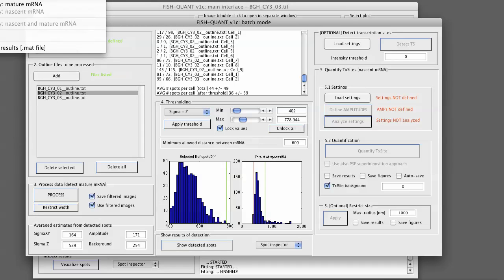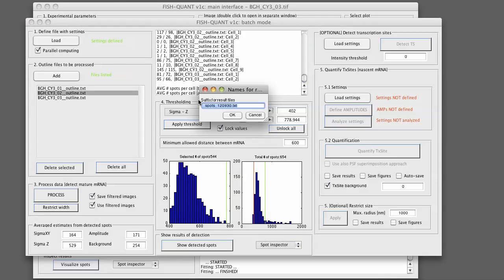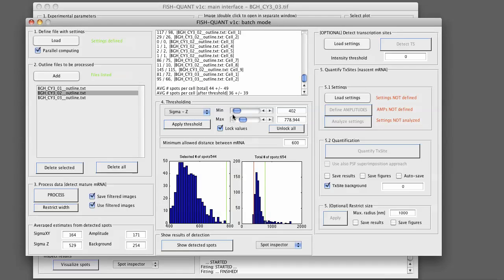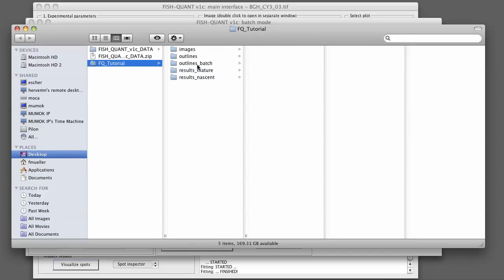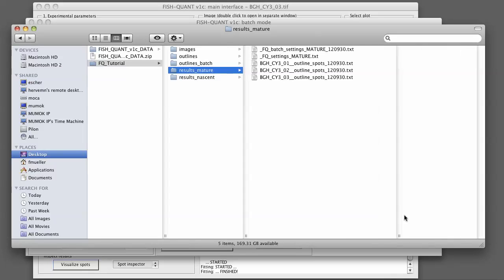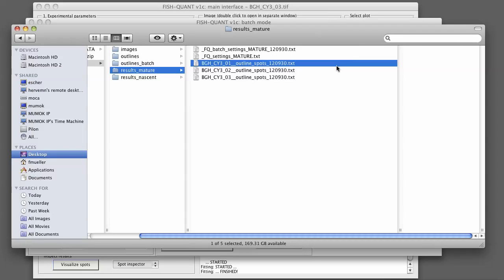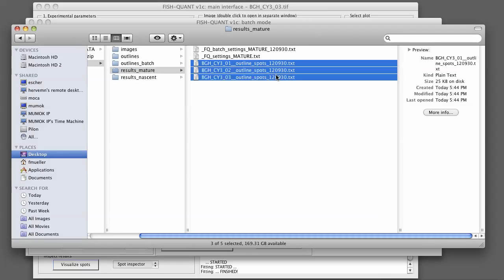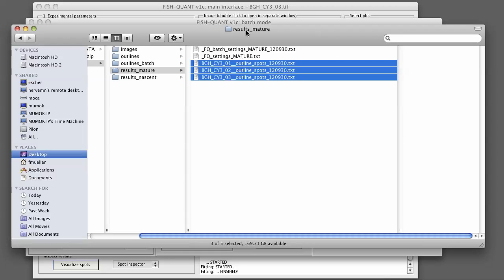You can save results of each image, all spots. This will save a separate file for each of the spots that was detected in the images. So each image file has a separate results file. This will be indicated by a suffix, spots and the date. So if we go back to our data, you see now that in results mature, we have three new files. Each of those files corresponds to the results of the detection of each of those three images.